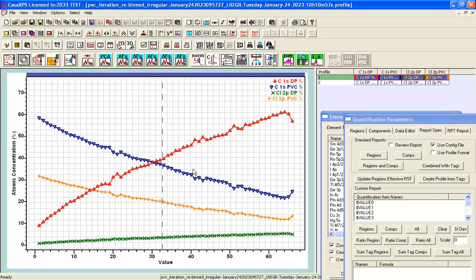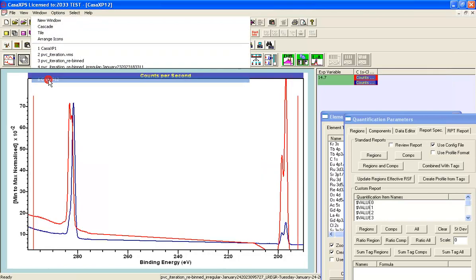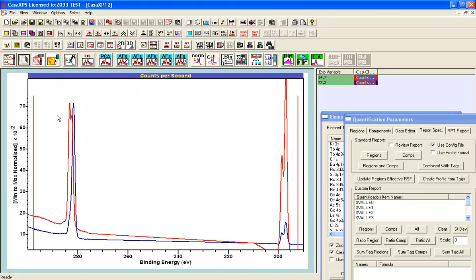we could then adjust the intensity so that we have an atomic concentration in terms of the degradation products and the polymer itself. Up to this point I've mostly concentrated on the mechanics and the mathematics associated with creating this profile. Now the aim of this profile is to monitor how the sample degrades, so we can see the degradation product and the original polymer, how it diminishes with time. But to really make these statements you have to look at the component curves and try and understand how much sense can be made of these component curves in terms of chemistry.